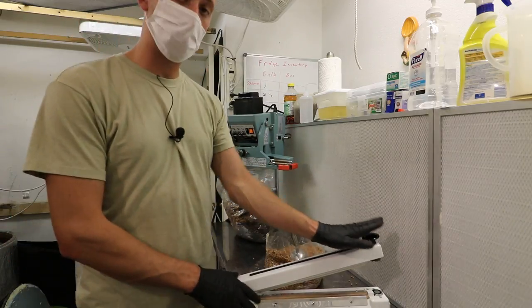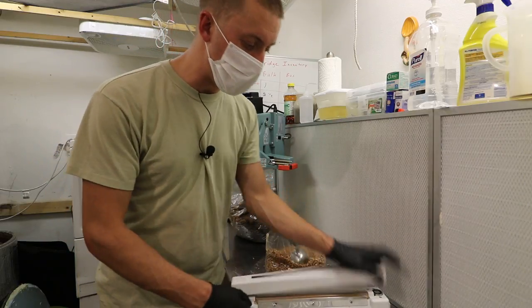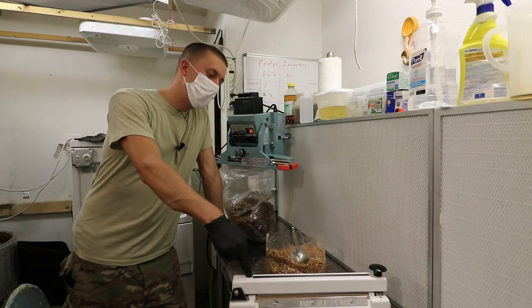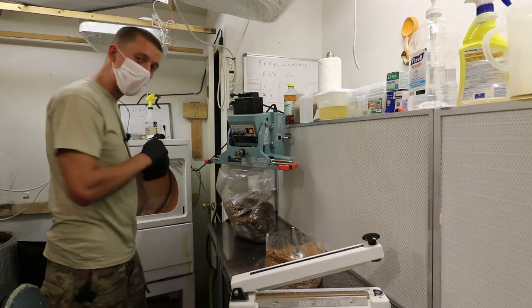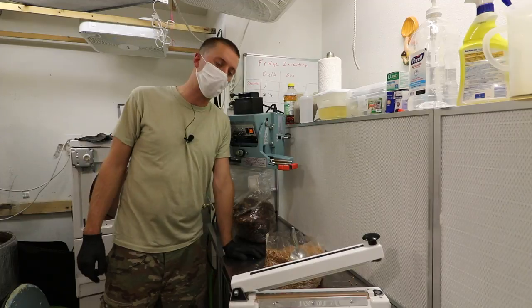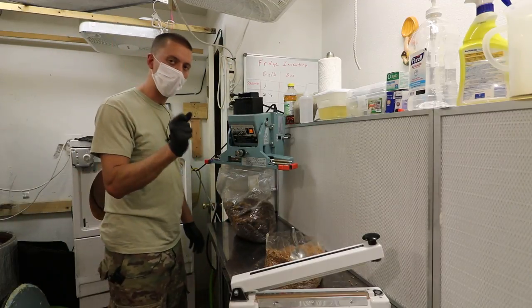With the magnetic-hold sealers — which are still great — you have to hold the bag with one hand and operate the lever with the other. These automatic ones are a great step above the regular manual ones because you can seal it and walk away to shake your bag while it's sealing and cooling, opposed to manual ones where you have to stand there and hold it for five to ten seconds. These are also much more repeatable with the cool-down since it's on a timer.